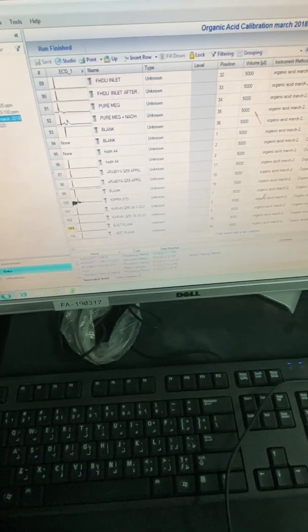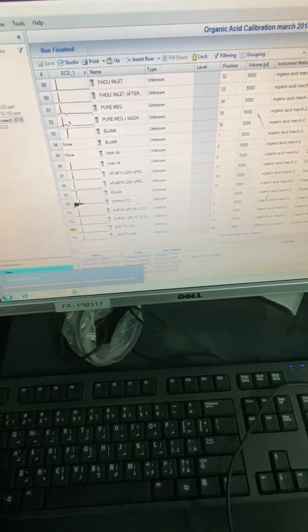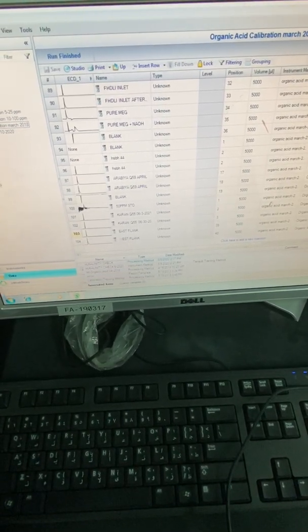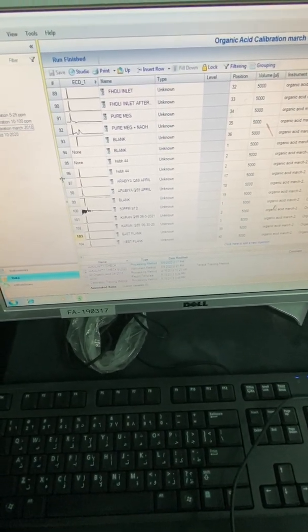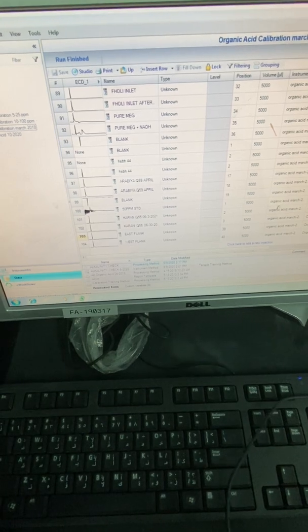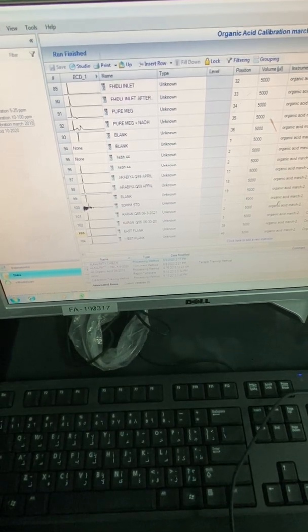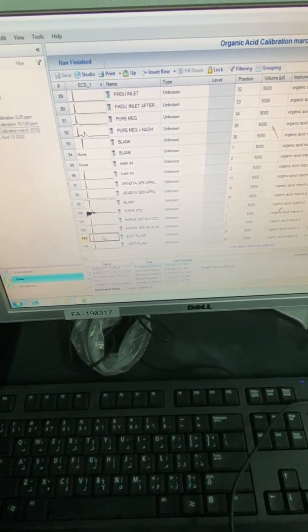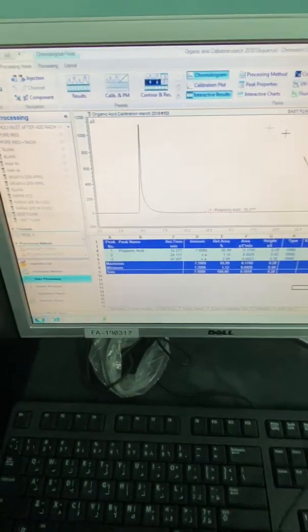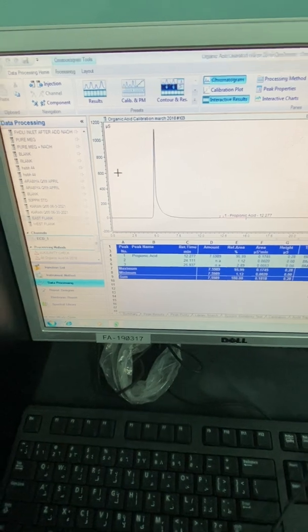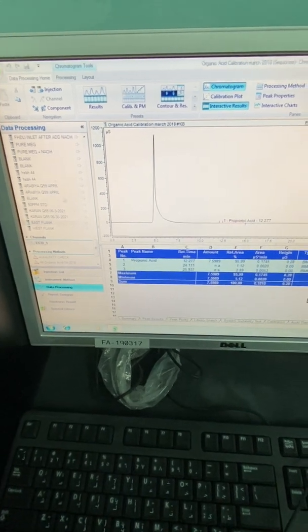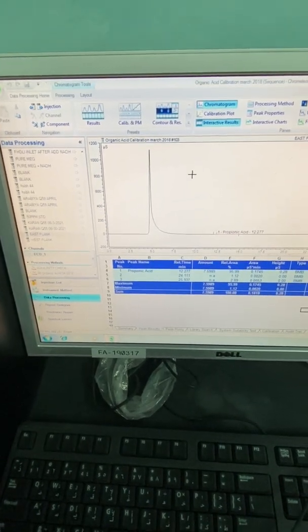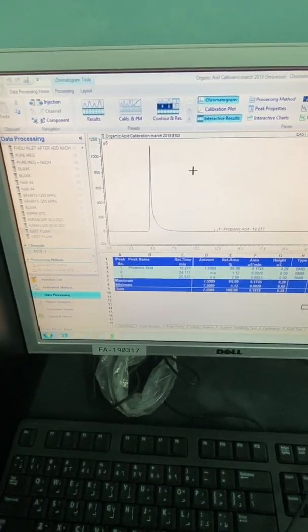To go to the other software, which enables you to do like new processing method or instrument method, just double click on any chromatogram. And then you will open the other software or the data analysis software.